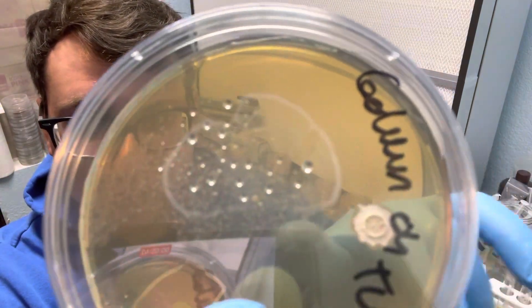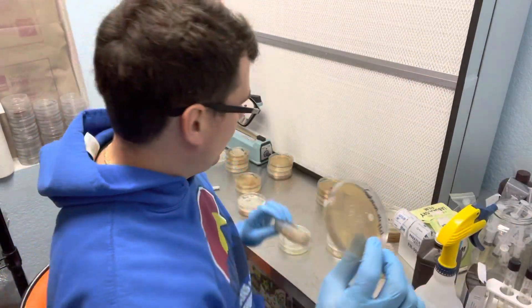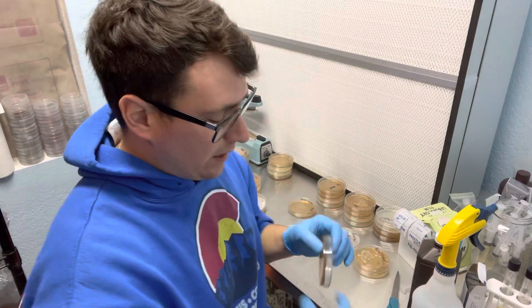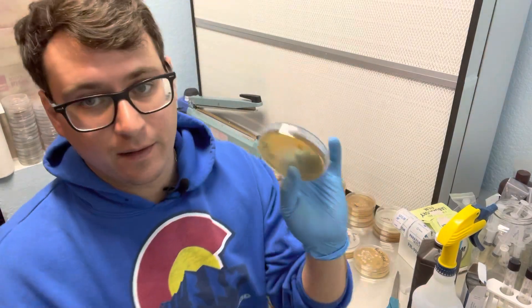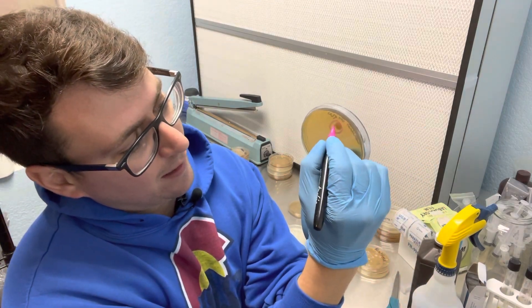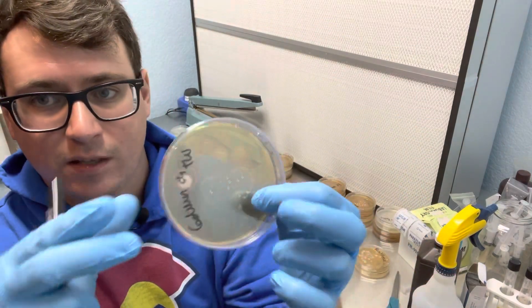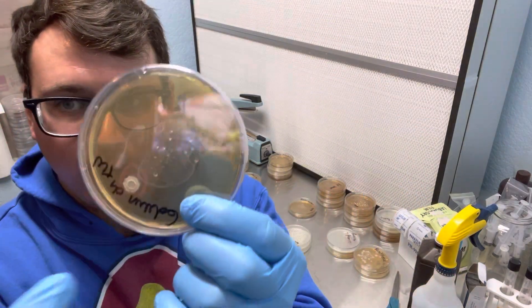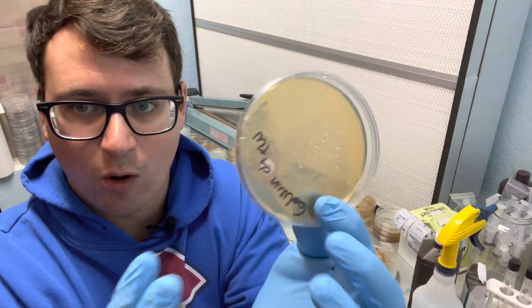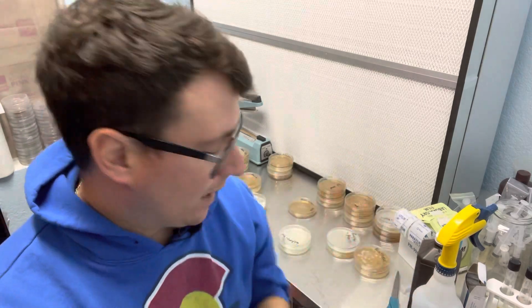I wanted to show you the difference between a bacteria and mycelium. So this is a bacterial colony here — it must have snuck its way in there after I did those initial readings. And then over here is where the mycelium is, so it's separated enough where I can pick some cultures. What I like to do at this stage is take my marker and mark bacteria in this section, so that in a few days when the mycelium grows over it, I can flip over and know not to take a section from that area.